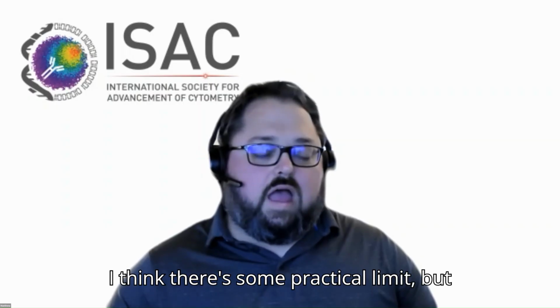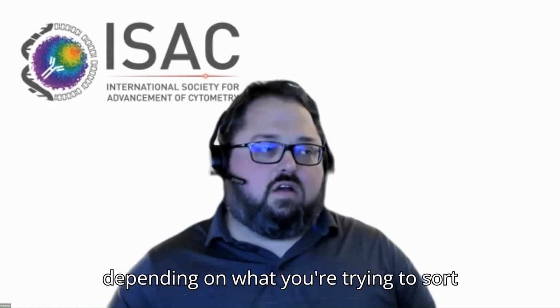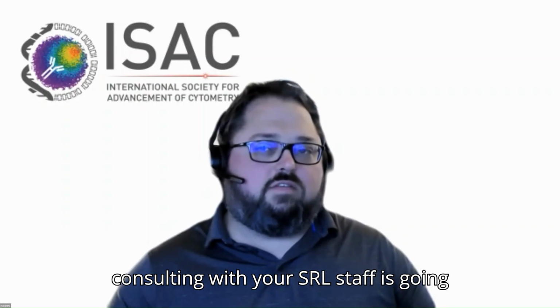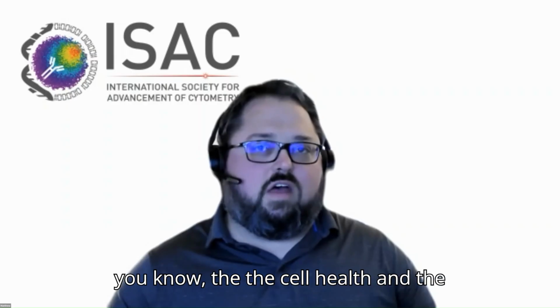So I think there's some practical limit, but I would say 15, 20, 25,000 is not completely out of reach, depending on what you're trying to sort and the sorting system that you're using. But this is one of those places where consulting with your SRL staff is going to be critical, because trying to get to those speeds can really affect the cell health and the outcomes of your sorted sample.